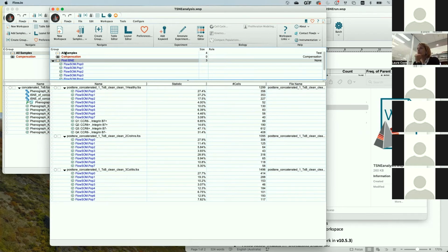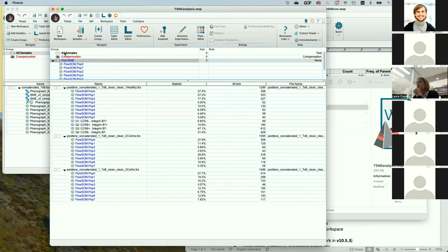How long does it take you to do, imagine that you're going full on in the number of cells that you want to analyze. How long will it take you normally to do the whole procedure with, imagine, 50,000 cells per sample or something? So the longest thing is the very beginning step. So in each experiment, opening up, making sure it's all compensated, doing the gating, and then right-clicking and exporting the population of interest to be concatenated into a separate folder. That's the pain in the ass step.